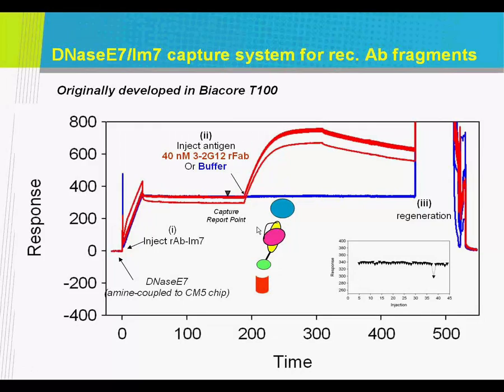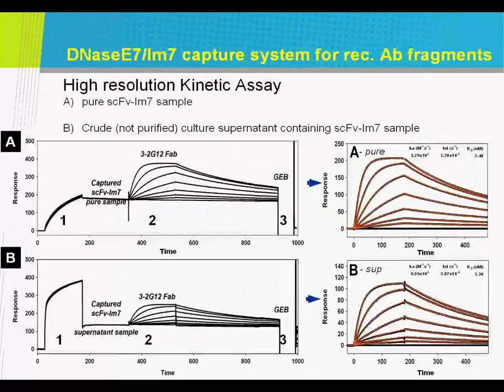found out about the ProteOn instrument, and I spoke to Bio-Rad Australia and eventually Bio-Rad US, and they offered to analyze some of my capture system over in the United States. And later on in that year, which was about 2 years ago, I was able to test the instrument by having it on loan. So that's back in 2007. So the data I show you is showing the performance of this assay that I just described in the ProteOn instrument. So just to remind you how it works in the ProteOn instrument.